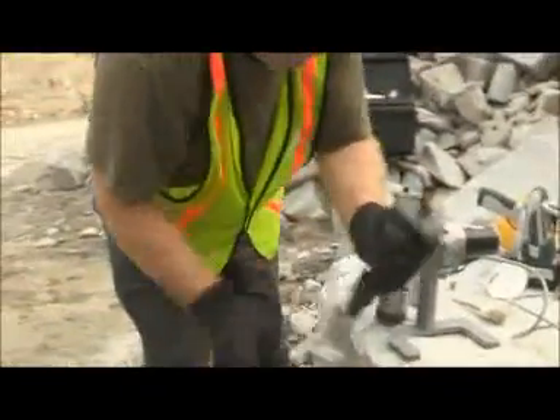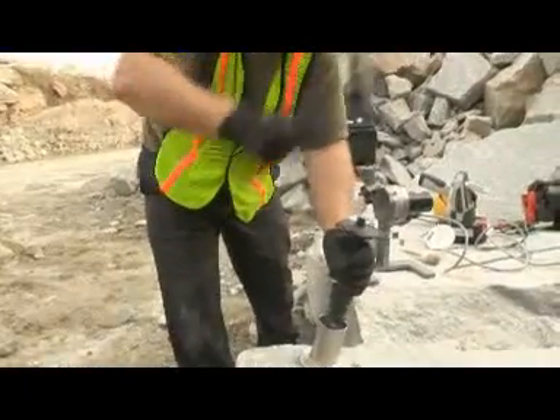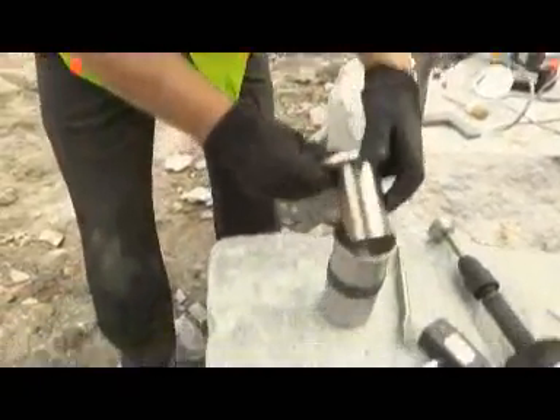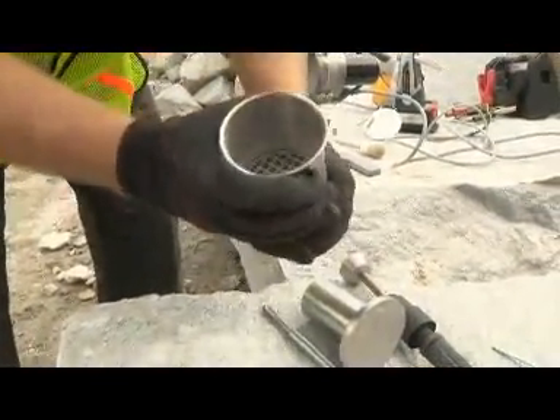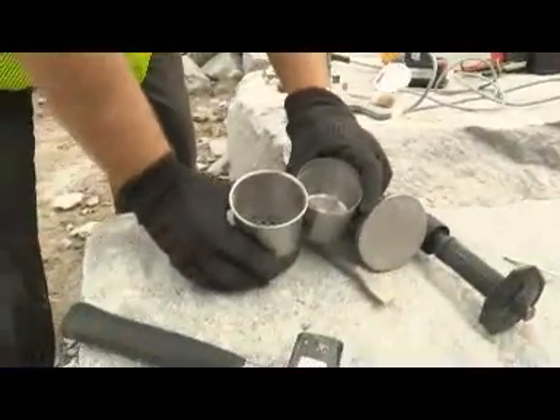Once the pieces are less than about 2 centimeters in diameter, insert the flat crusher attachment into the holder. Several blows of the hammer should be enough to reduce most of the rock to less than 8 millimeters, which will then need to be sieved. Transfer the material in the bottom of the crusher base into the sieve. You can see here that the rock is now the appropriate size to deliver to the mill.